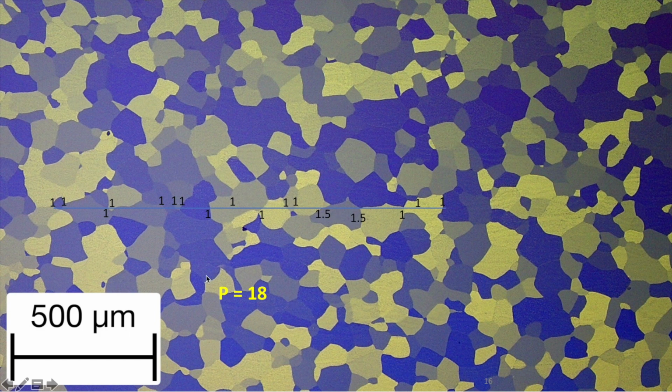And what you find is that p and n have come out to exactly the same number, 18, which is fantastic. That should be the case. Most of the time it should be the case. And so really it's up to you which technique you want to use, which one suits you. I actually prefer using p, the number of grain boundaries intersected. The test standard says there are certain circumstances where you may want to use p or n, depending on the type of method or microstructure you're looking at. But I usually use p, but use whichever one you want. It's up to you.